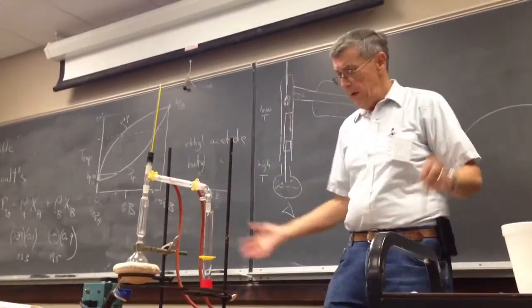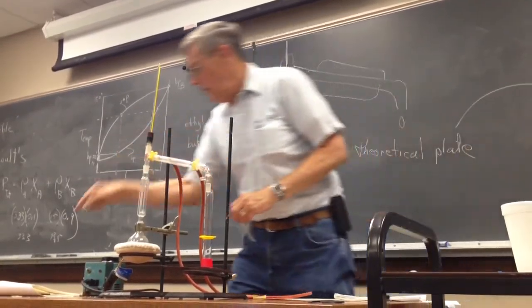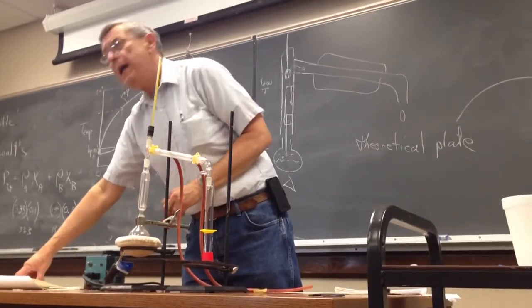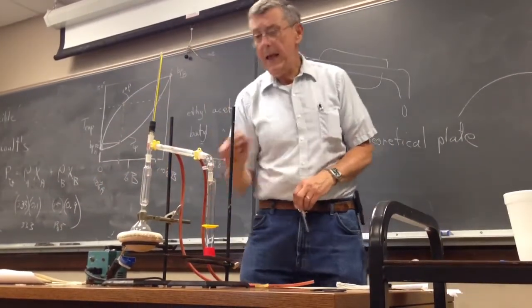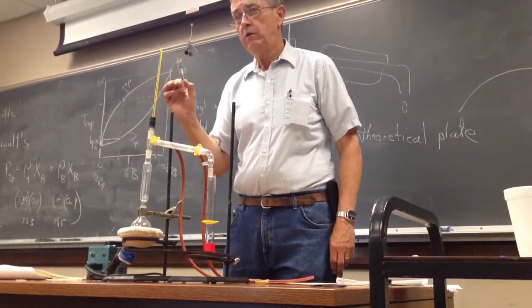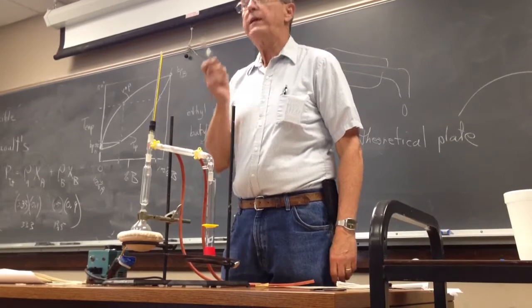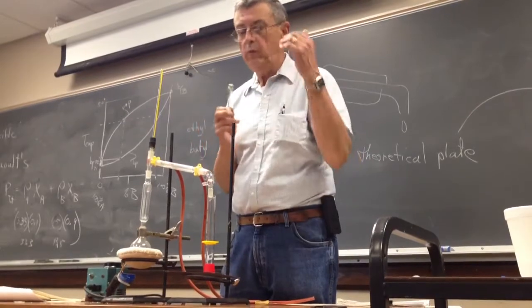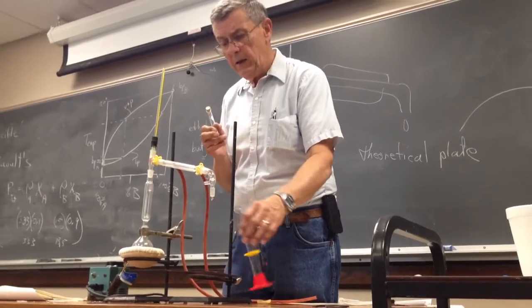Now the distillation is kind of going. It's finally gotten hot. I'm beginning to see some liquid come down. And the chart tells me the first 2 mils into test tube A, and then I write the temperature. So I'm going to collect 2 mils, not in that, but in this, and then write the temperature. The first temperature gets recorded at the end of the first 2 mils. Every temperature gets recorded at the end of the collection of 2 mils, either in a test tube or in the graduated cylinder. So, okay, it looks like it's about ready to come over.